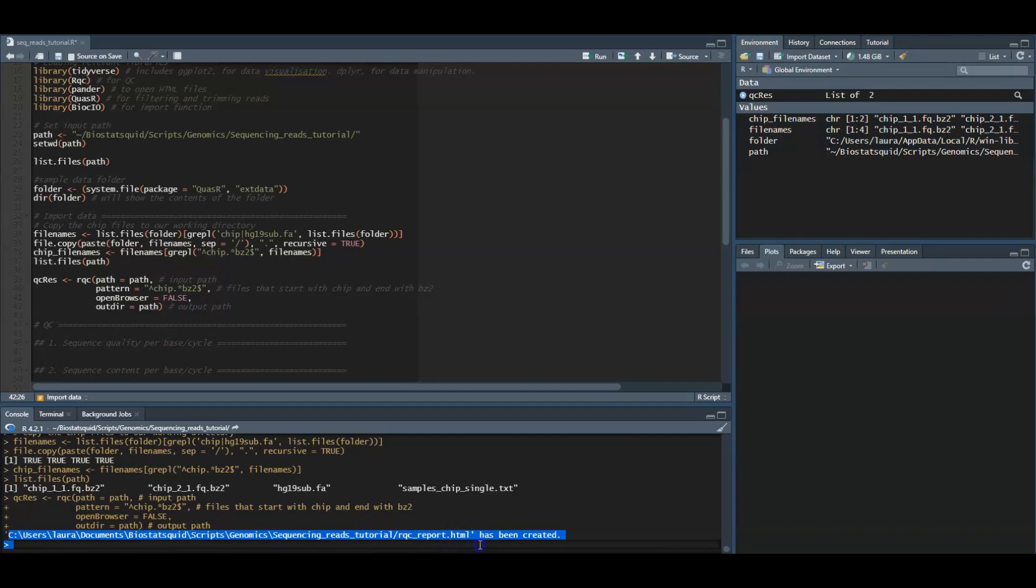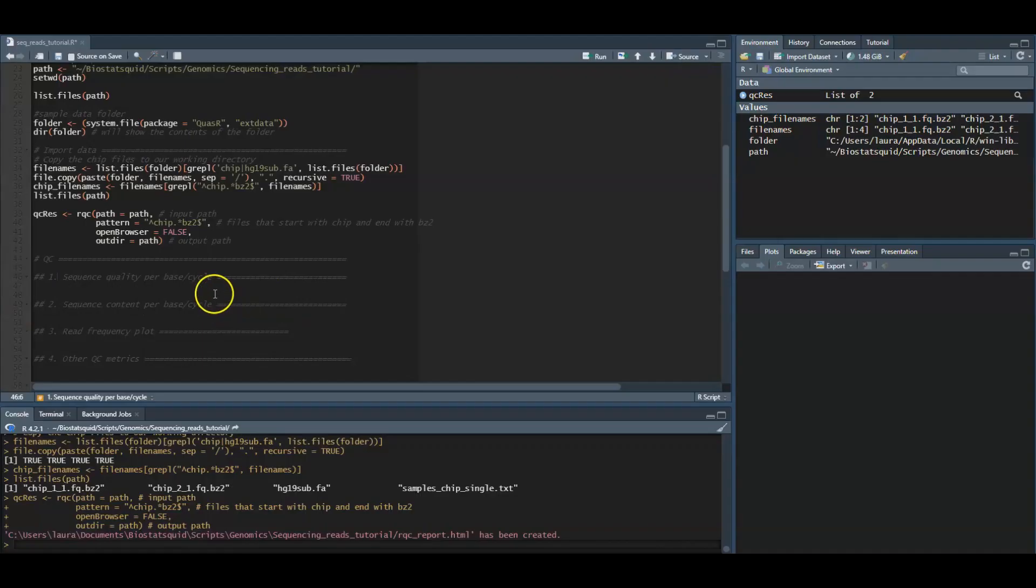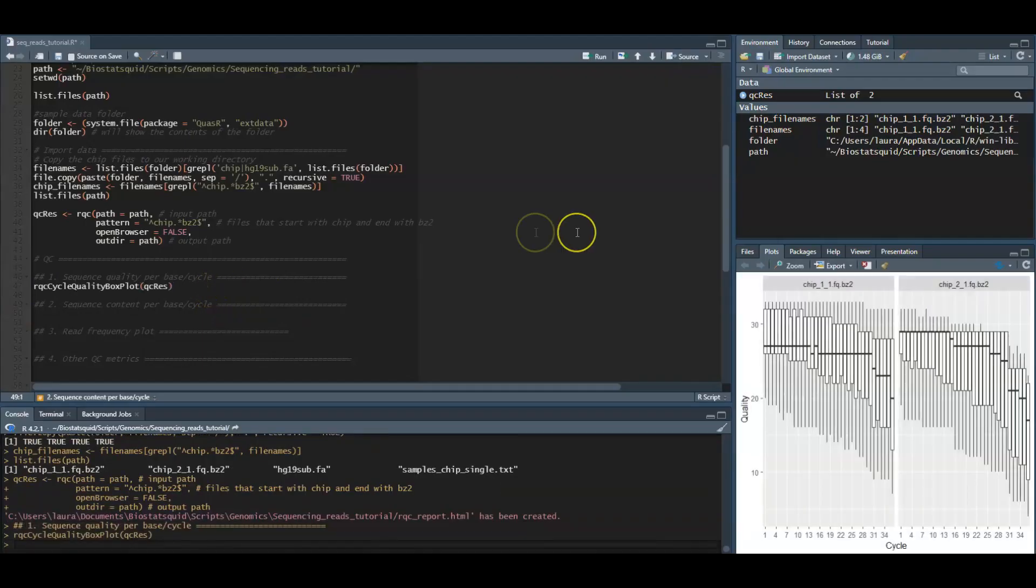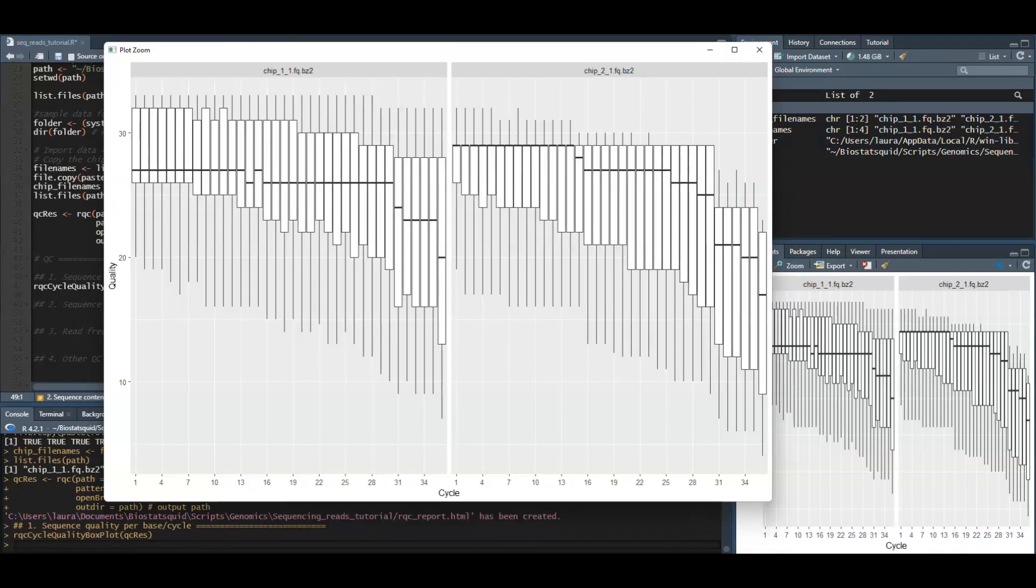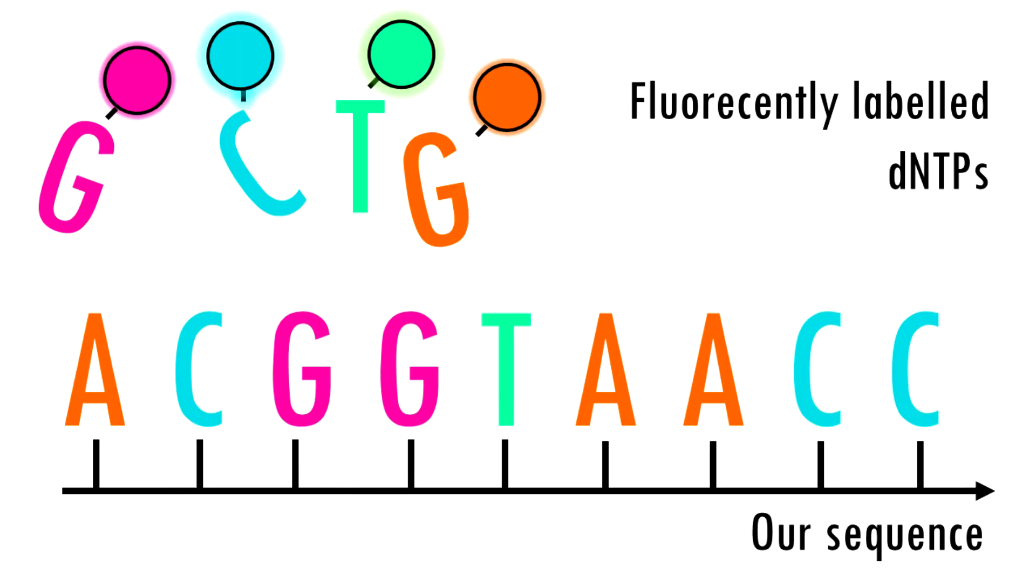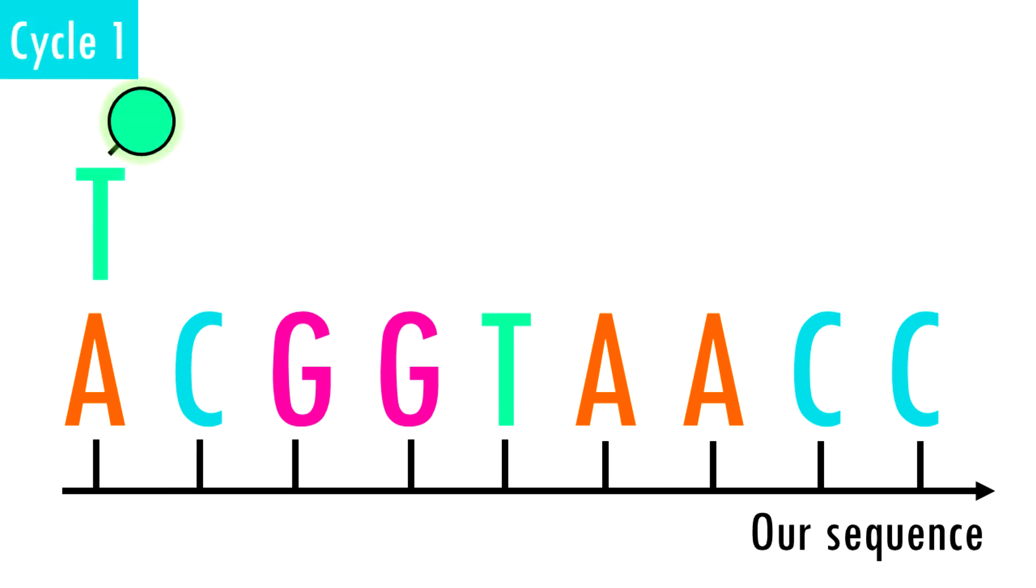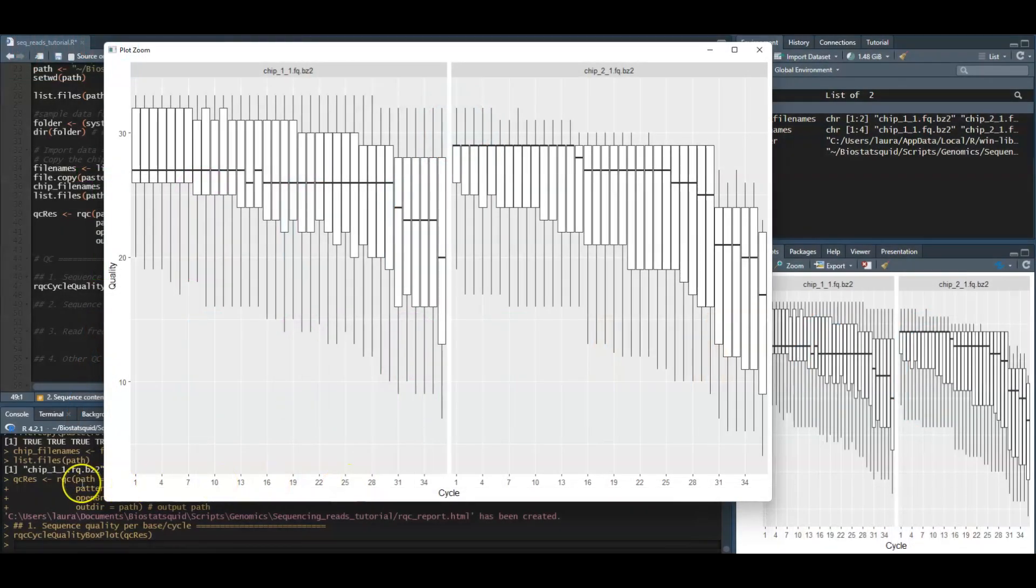We will first plot the sequence quality per base or cycle. This plot shows the quality scores across all bases at each position in the reads. The x-axis shows the position of the reads, labeled as cycle. This is because in each sequencing cycle a fluorescently labeled nucleotide is added to complement the template sequence and the sequencing machine identifies which nucleotide is added. In cycle one we determine what the first base in all fragments is. In the next cycle the machine determines what the second base is. The first cycles correspond to bases or nucleotides along the read, and the number of cycles is equivalent to the read length.